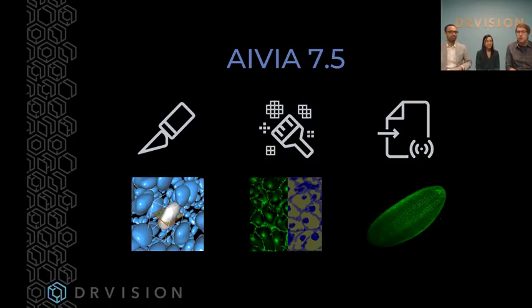So currently, no, it's just going to be the XY planes. And so also the drawings will all be made on the XY planes. We haven't made a good way to draw in 3D yet. Can you say the question again? So training in 3D images. XZ. Oh, okay. Nope, not currently.